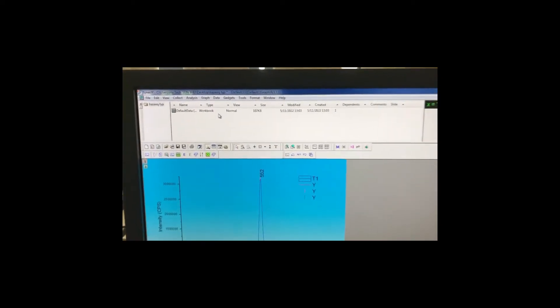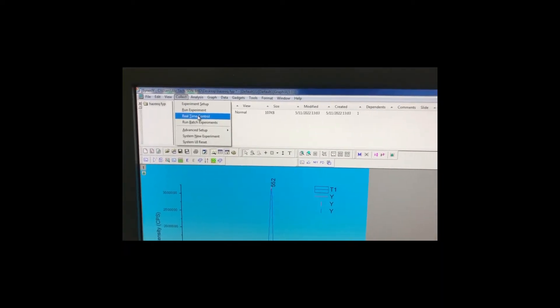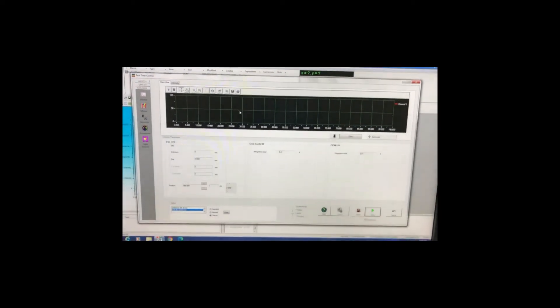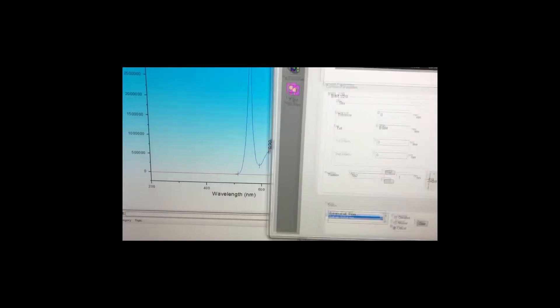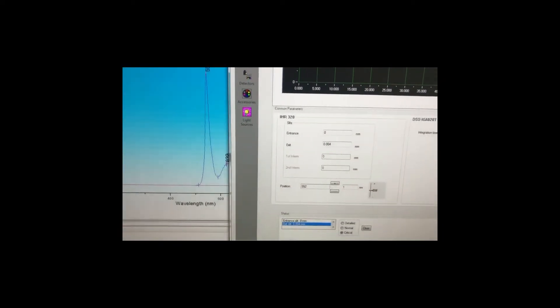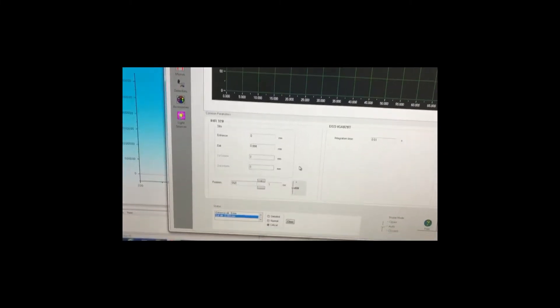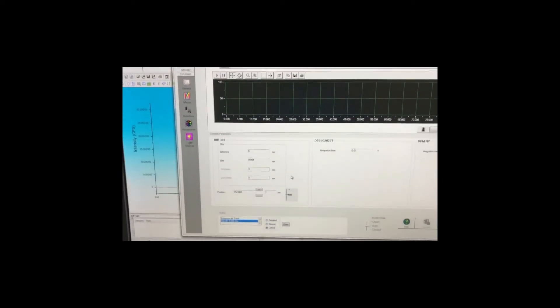To do real time control, first we need to click on collect and click on this real time control. This is what it looks like inside and then you need to change the position here to the number that we have got just now, 552. Change it to 552 and then you click enter.